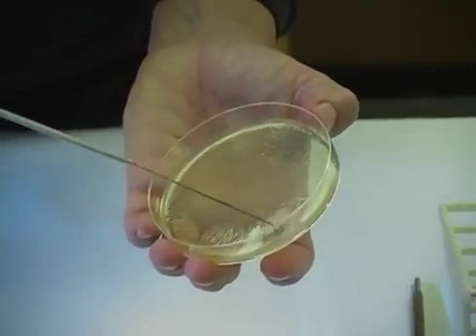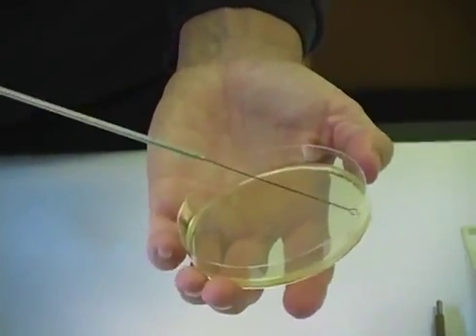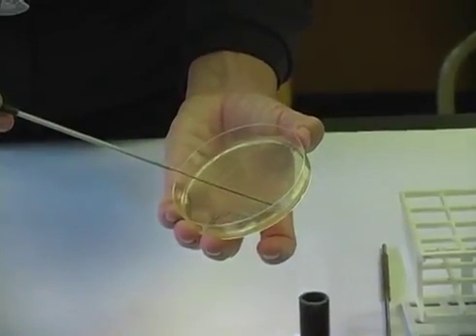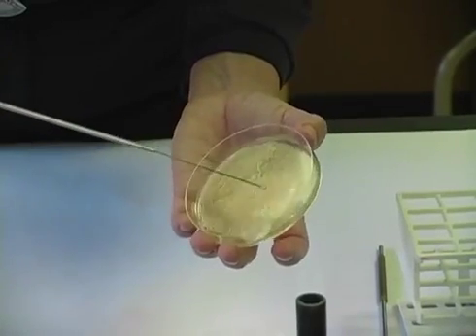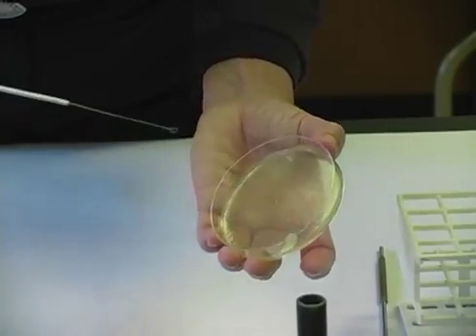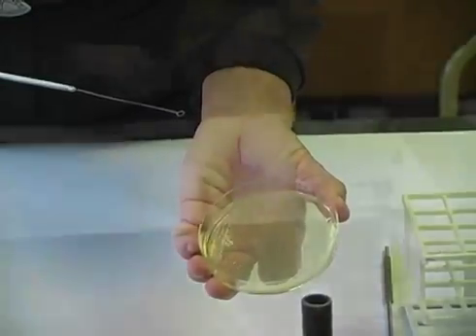Cooling my loop, transferring some of the microbes from quadrant 2 to quadrant 3, streaking them or spreading them over the surface of quadrant 3. Cooling my loop, transferring some microbes from quadrant 3 to quadrant 4, and then using large lightning bolt type streaks to spread those bacteria over the surface of quadrant 4.